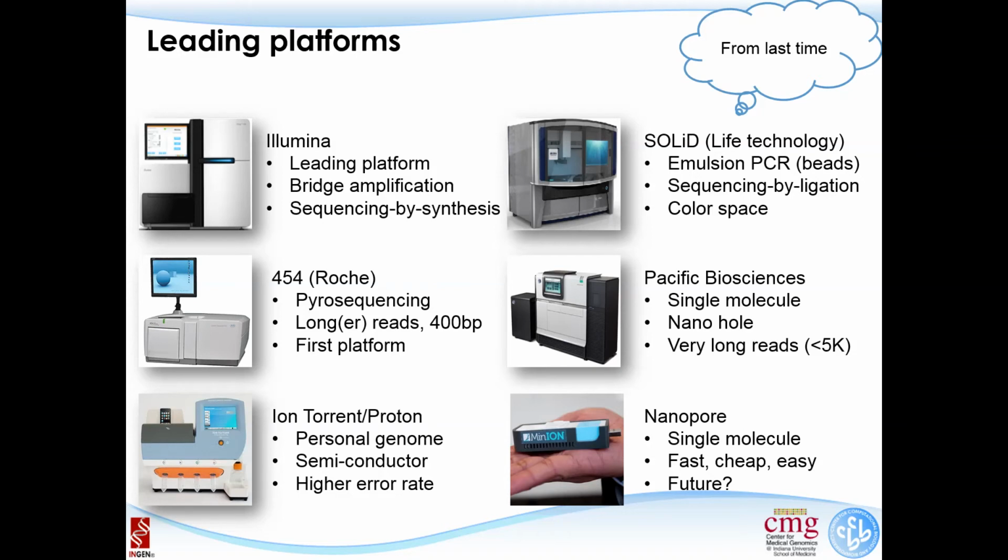And the second one is the sequencing. For the Illumina platform, the amplification is the bridge amplification. You remember I showed you how one tree becomes a little forest. And then we do the sequencing by synthesis. In each step, one colorful nucleotide comes in, and then we take a picture, get rid of the blockers, and put another nucleotide on, and so on and so forth. While you are synthesizing the DNA molecule, the sequencing is being measured. So that is bridge amplification and sequencing by synthesis.